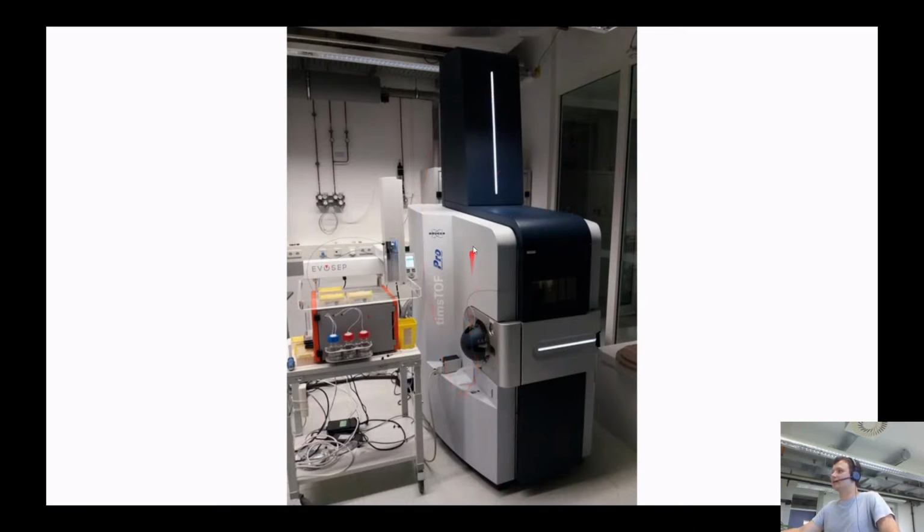a device like that. It's called the Bruker timsTOF, but the key word here is TOF. This instrument looks like that. So all samples, this is the HPLC here. All samples first of all go through chromatography, all peptides or proteins. Next, we're coming here to the electrospray. This electrospray ionizes molecules. And these molecules fly into the instrument like that.